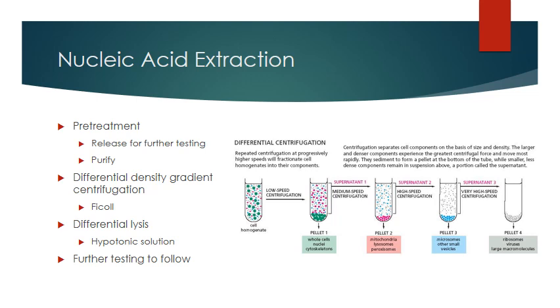And that'll allow you to separate significantly enough the white blood cells from the rest of the cellular matter. Basically, your white blood cells are going to settle into a layer in the Ficoll, which will be below the plasma components, which are less dense, but above the other cells, which are more dense. And then you just have to remove that Ficoll layer.